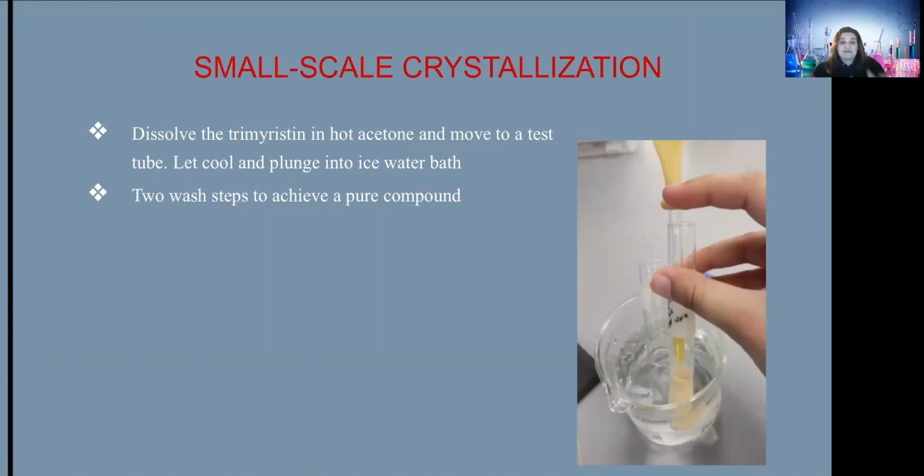Now, let's say this had to dry rather quickly. In your case, you had to let this dry overnight. So in order to allow this to dry overnight when it's completely white, if we have our test tube and you did all your purification, now you have just white solute, you have your white crystals.